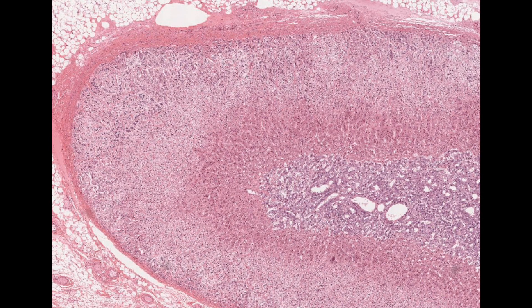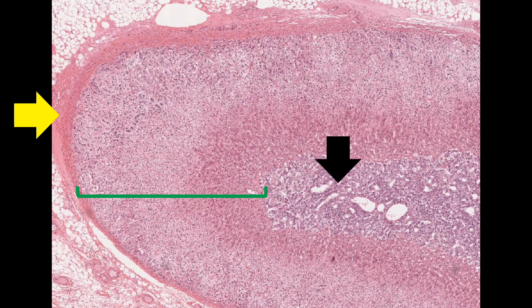This slide shows a cut section of the adrenal gland. This is the capsule, this is the adrenal cortex, and this is the adrenal medulla. Let us discuss the adrenal cortex and adrenal medulla one by one.